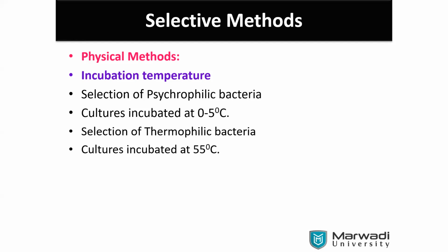Initially, we kept our plates in the incubator at 25 degrees centigrade, where the fungi were growing. So they got the opportunity. The spores are there in the air. That is why it is also not advisable to open and close the incubator continuously. Fungi were growing over there. Some are useful, some are harmful, like Aspergillus niger. It may cause skin disease, or at least skin infections are possible.